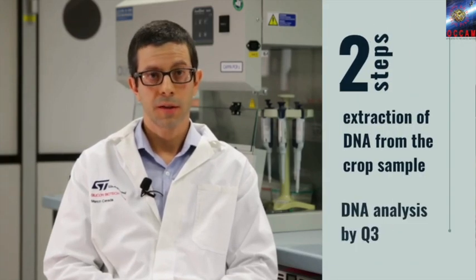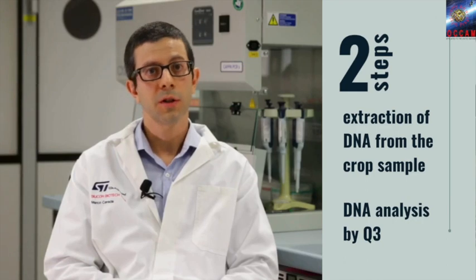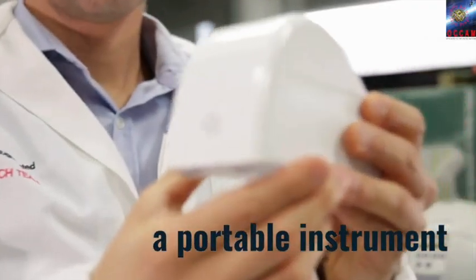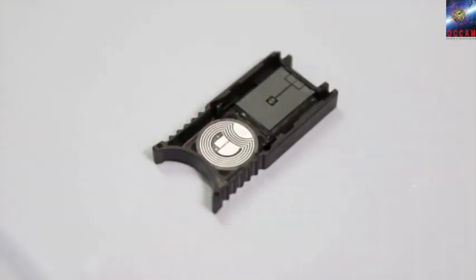Then, in the second step, the extracted DNA is analyzed by qPCR on a system developed by STMicroelectronics, which is called Q3. This system is composed of 3 elements: a single-use cartridge, a portable instrument, and a software application. Besides this, specific reagents for each target DNA sequence are needed. The cartridge is the core of the system where the reactions occur.